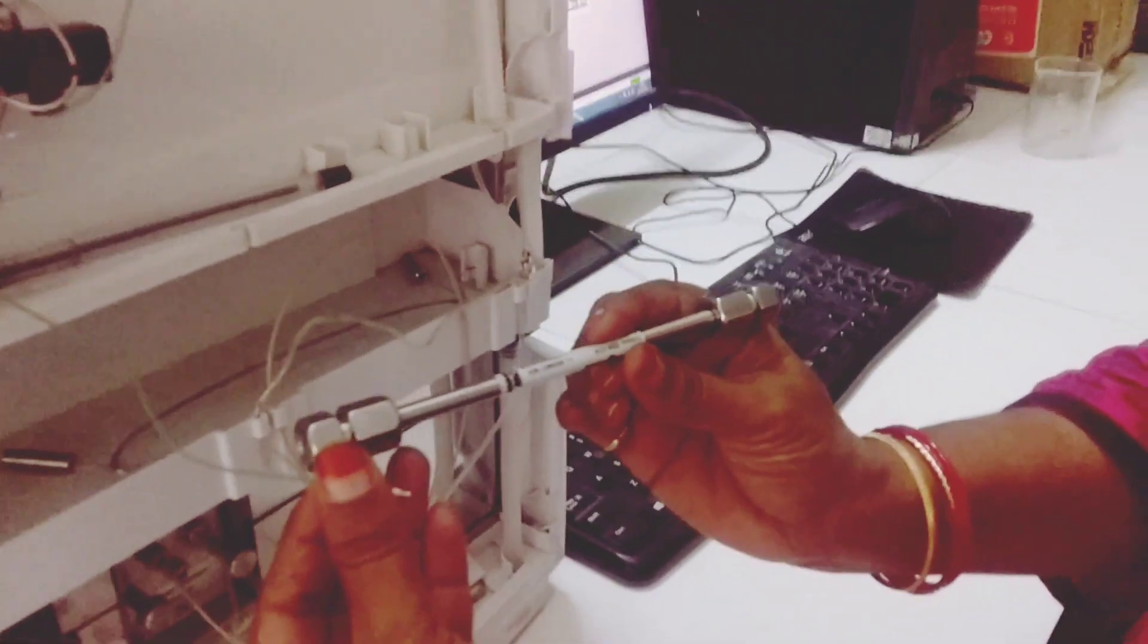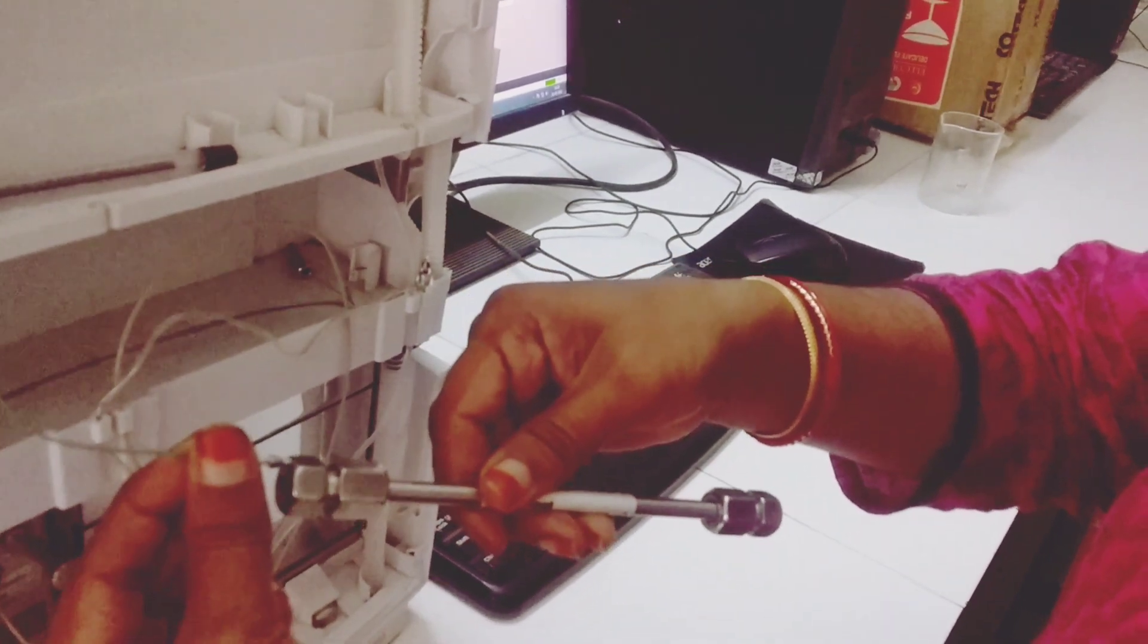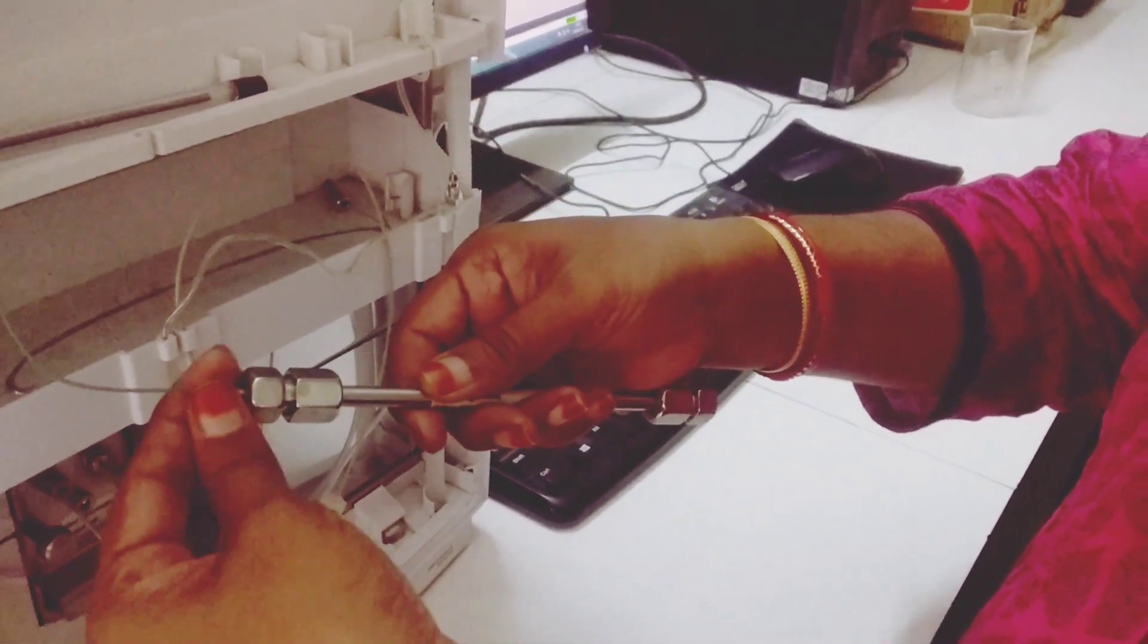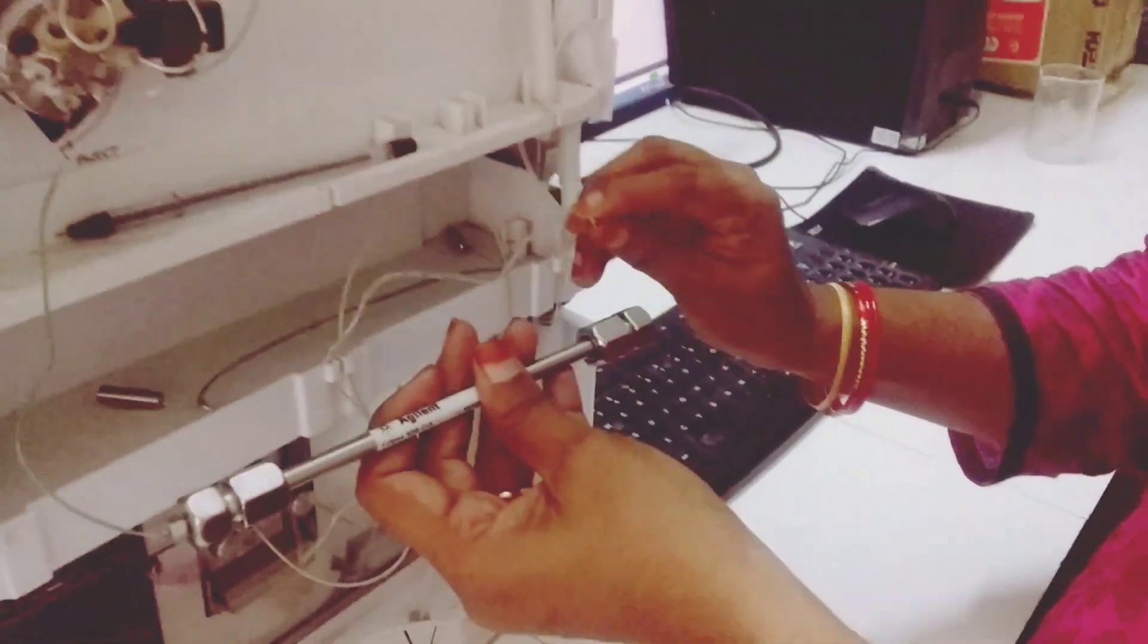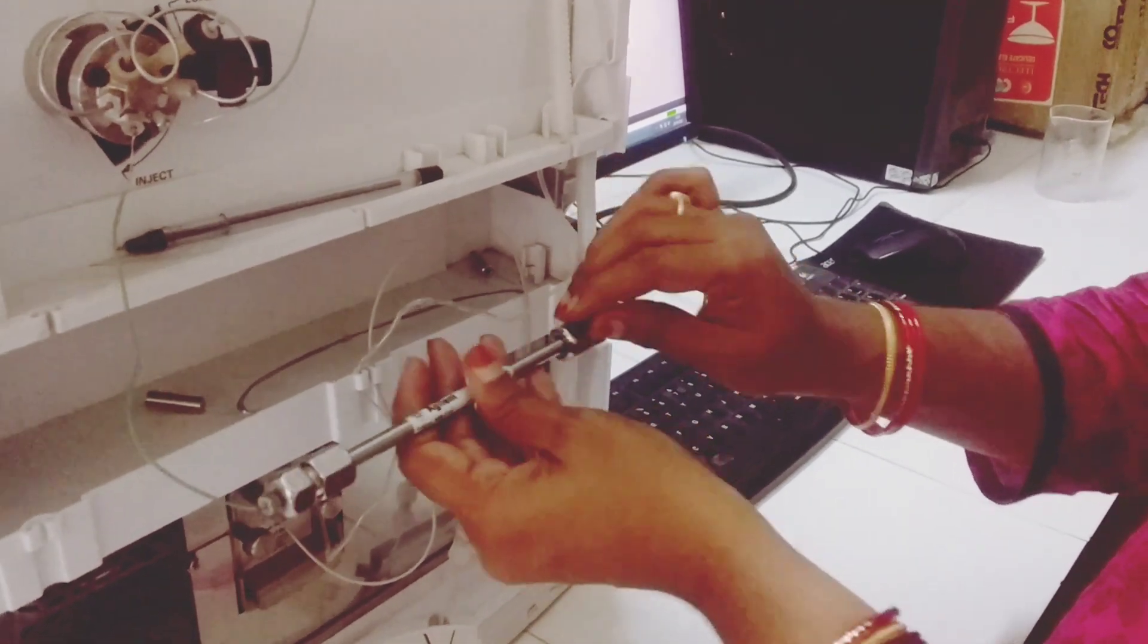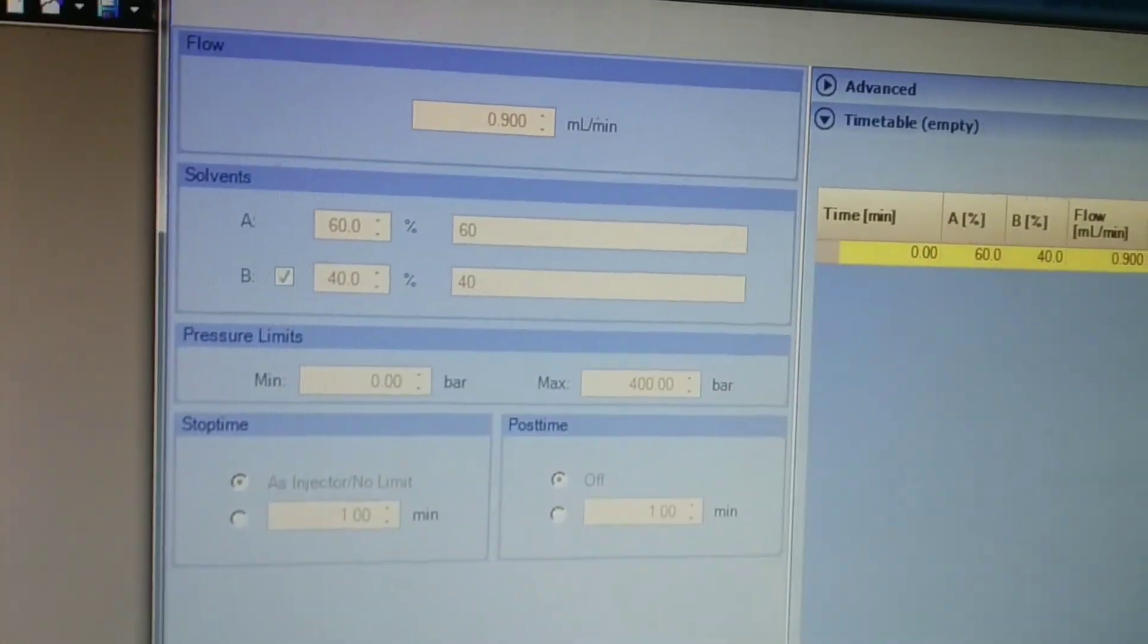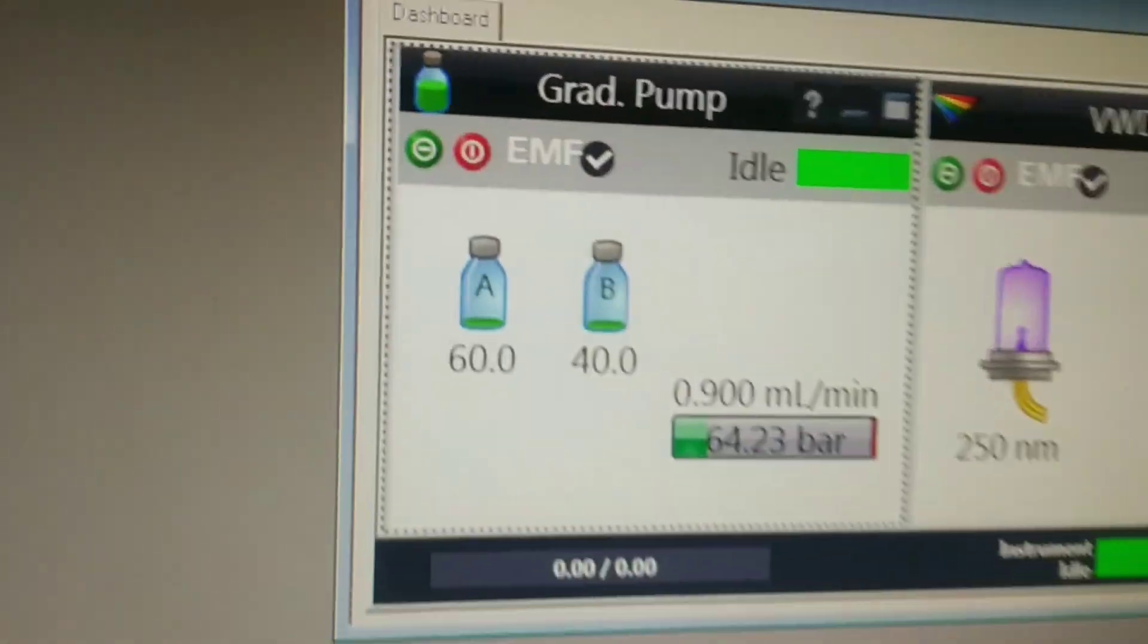Once it is done, I will be reversing the column again, and then for the correct flow path, I will install the column and run the solvent mixture with which I want to do the sample analysis. Next, I will be checking for confirmation of the efficiency and also check that the pressure is back to normal conditions.